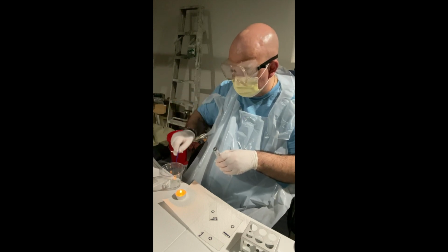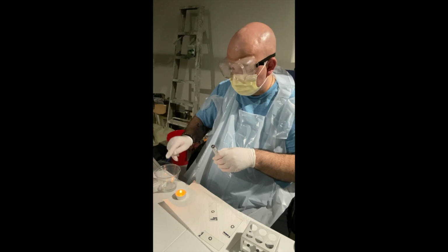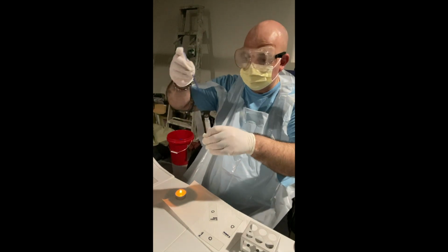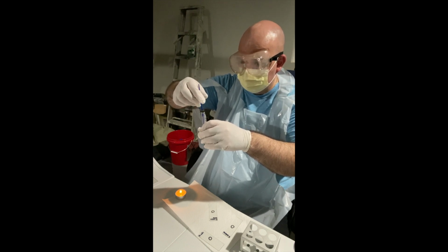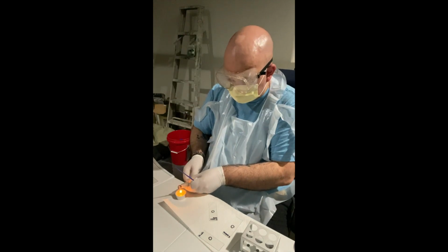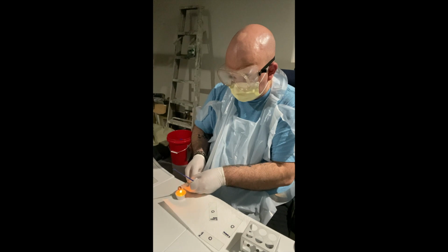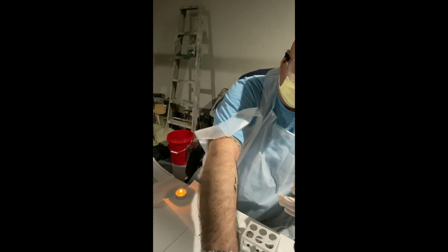My third and last inoculation loop. Just gonna bring the alcohol off. Side. This is going to go straight down into my culture. Straight back out. Hold this and flame it. Okay. Lid back on. Set it aside.